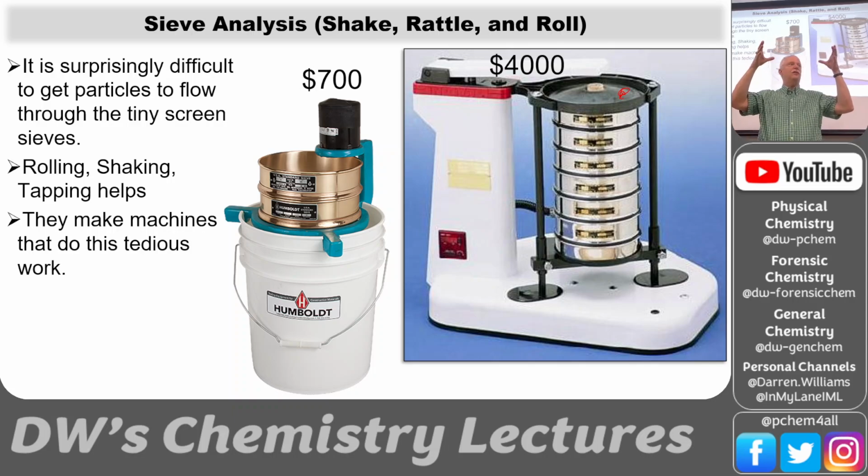So the largest holes are in the top, and you wash the sample, and it goes through the biggest hole. Then the next one has smaller holes, and that traps a little bit more, and the rest falls down, and the next one traps, and so you have all of these different sieves. You would calculate the percent passing on these sieves, so if 80% passed the big sieve and then 60% passed the next sieve and so on, then you could plot out the cumulative, or the integral, of the particle distribution curve, and we'll see those in a second.